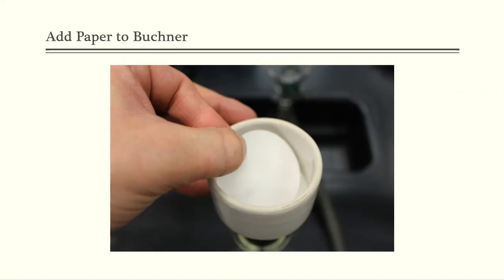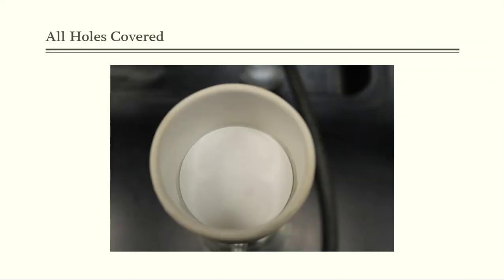And then I'm going to take that filter paper and put it into the top of the Buchner funnel. Again, it fits perfect. It seats down into that funnel exactly. It is made to fit. I mean, that's why we order the sizes that we do. But notice that all of the holes that you saw previously down here are covered. That is one of the mistakes that people make in a laboratory: they choose the wrong type of filter paper, or they don't ensure that all the holes of the Buchner funnel are covered up with the filter paper. And if you don't ensure that all the holes are covered up, then guess what, folks? You're going to be losing your product along the way, and nobody wants to do that either, right?